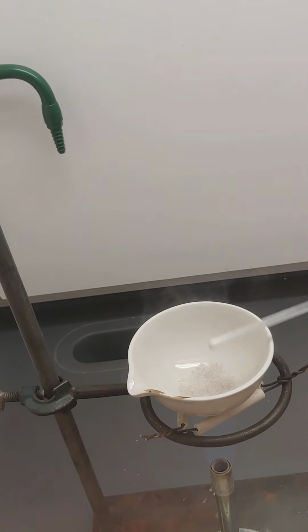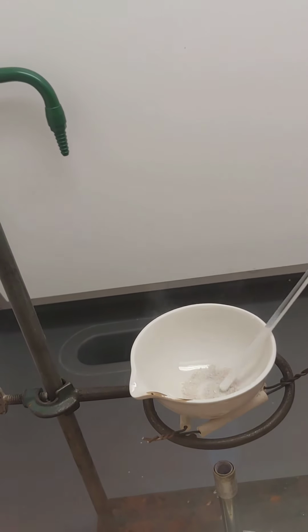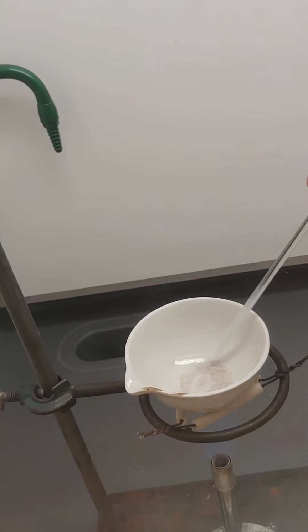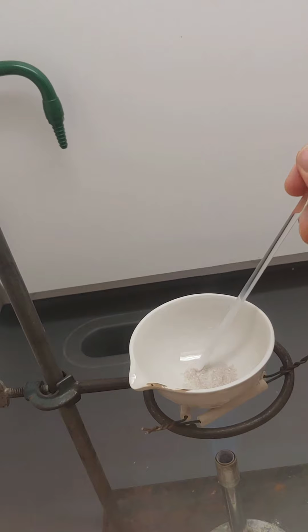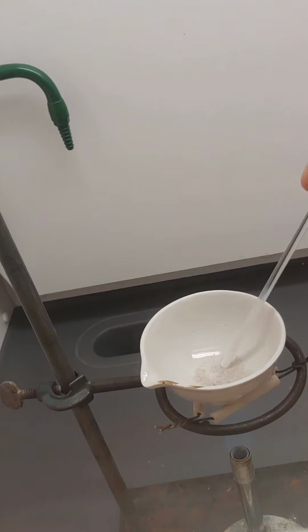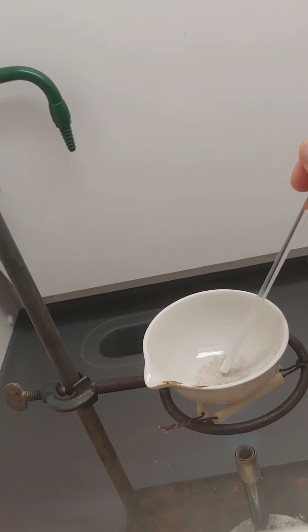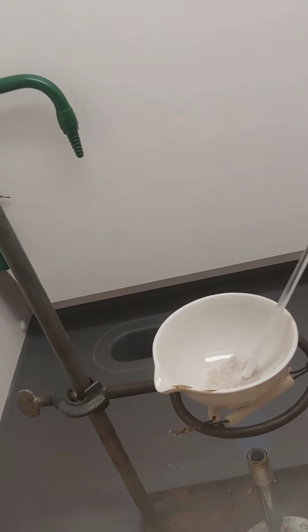What's important for me is that I make sure that I don't get any of the other two compounds stuck on the end of the stir rod, that I could also be getting some of the sodium chloride, and I could also be getting some of the sand adhered to the tip of my stirring rod. So that could be a potential source of error down the road if my results are askew, that it might be that some of my samples stuck to the tip of the stir rod. So I'm going to let this keep going for a little bit, and then when it's all done, we'll take it off of the heat, allow it to cool, and then we'll weigh it to get a final weight after heating.